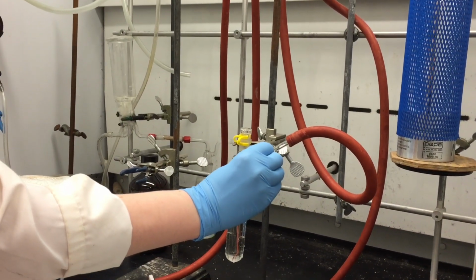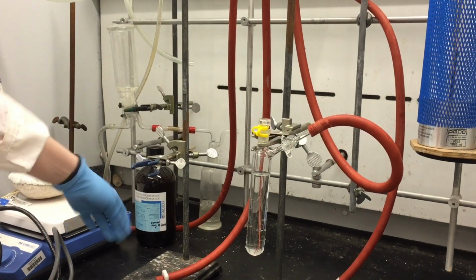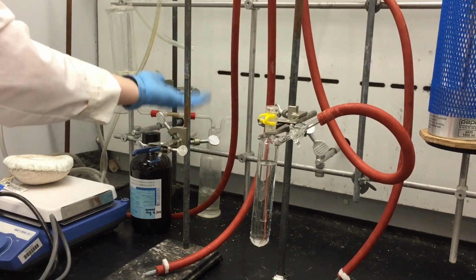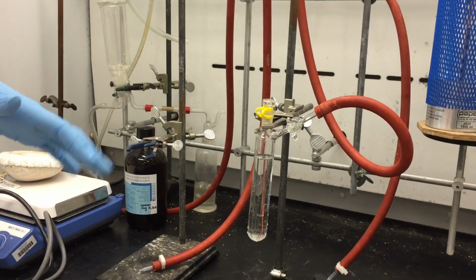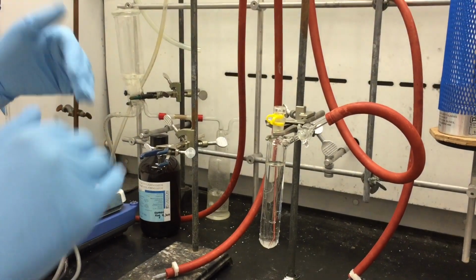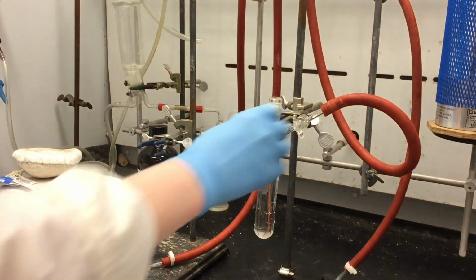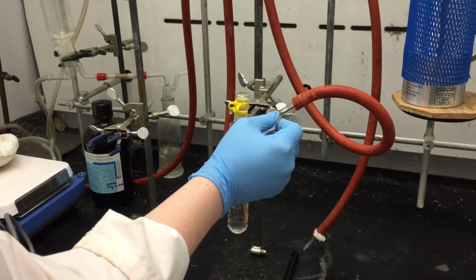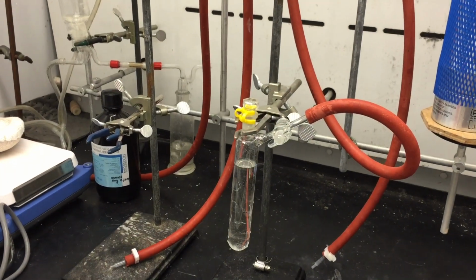You're going to open it very slowly, and if you open it too quickly, you'll see the bubbler actually backtrack up there, and that means that the pressure differential is too much, so you need to definitely slow it down. Okay, so there we go. So now we're under nitrogen.